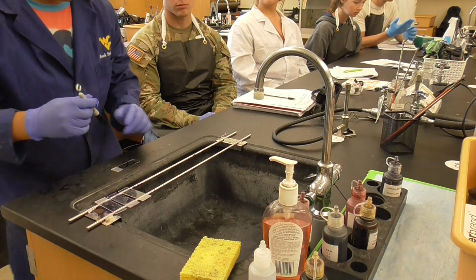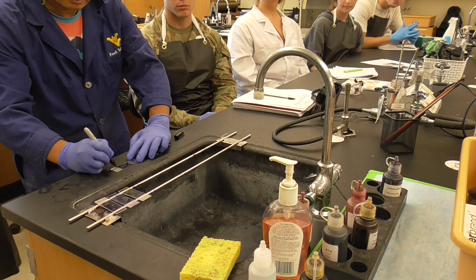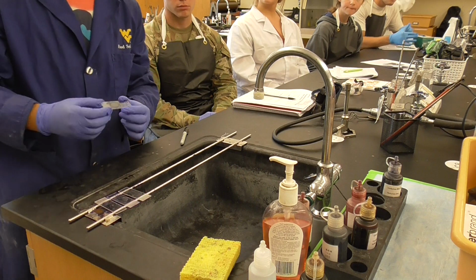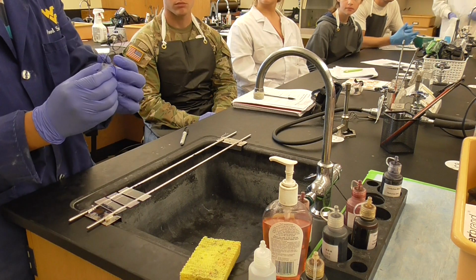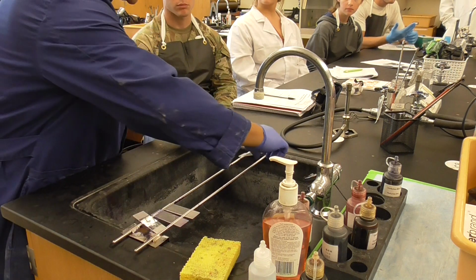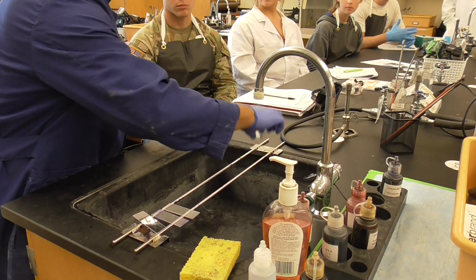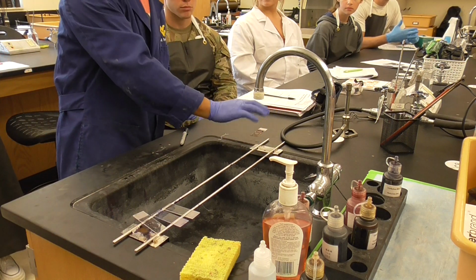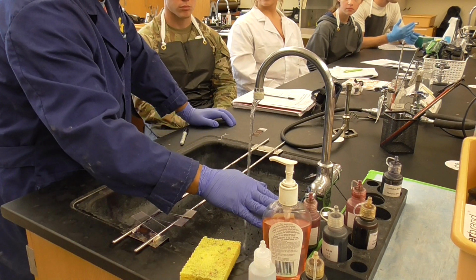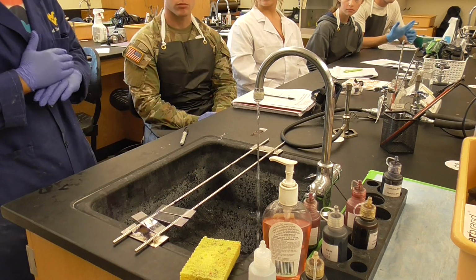Okay, so you're going to label them EC and BS. I'll just put it on the camera like this, and then we have to flip it over. Okay, that is important. Flip it over, we're going to put it right here. You can do it right here, or you can also do it around this corner. Now make sure you checked the water. It is working, but not flushing.